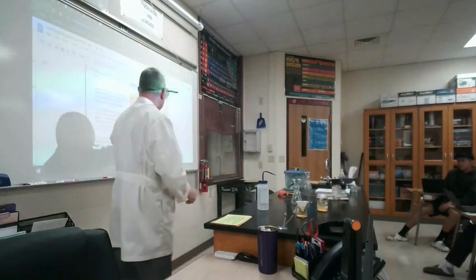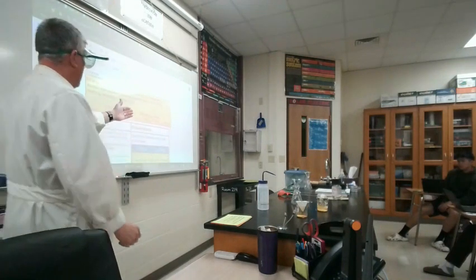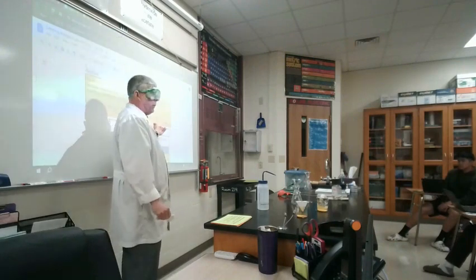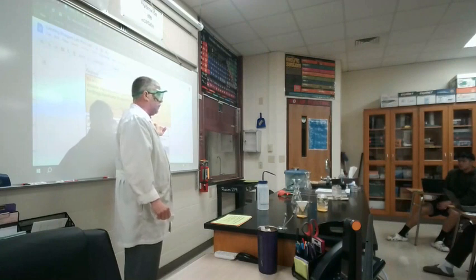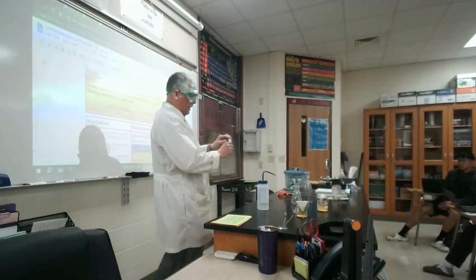Here is why. In this lab, we already have ions running around in solution. Sodium and nitrate. We don't want any more ions running around. We don't want chlorine or fluorine ions that are in our drinking water. So we use deionized water.